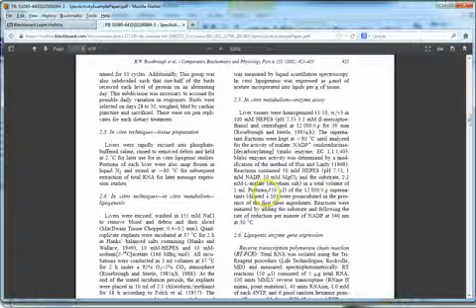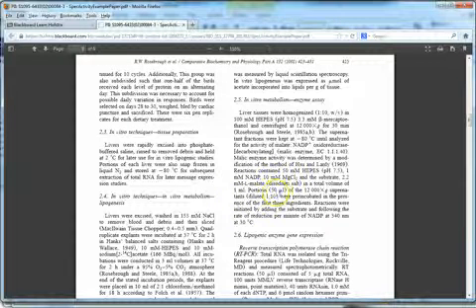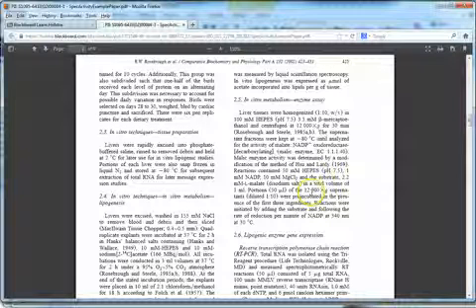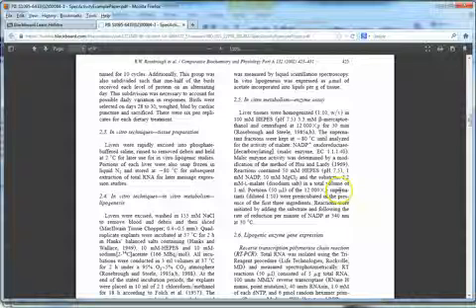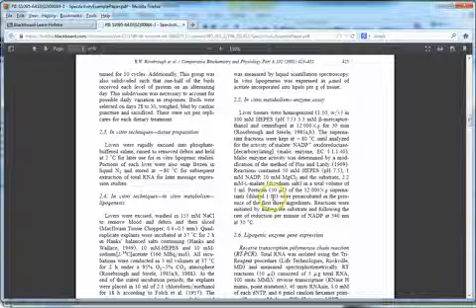In a total volume of 1 ml. Portions, 50 microliters, of the 12,000 G supernatant. Now, we didn't look at this, but once they made their homogenate, they spun it first and kept the top part. That's the supernatant. So, in other words, you can just fill in homogenate for 12,000 G supernatant. Portions of the 12,000 G supernatant, now, they diluted theirs 1 to 10 first.